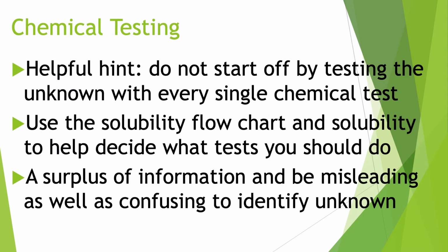The chemical testing, I'm going to say this, the worst thing that a student could do if they're trying to figure out what an unknown is, is to grab all the different chemical reagents for chemical testing and start testing them left and right, because there's no need to do every chemical test. And if you have a surplus of information, sometimes that can be misleading, and it can also be quite overwhelming to try to figure out what the data is telling you. So probably the best place to start is with solubility.